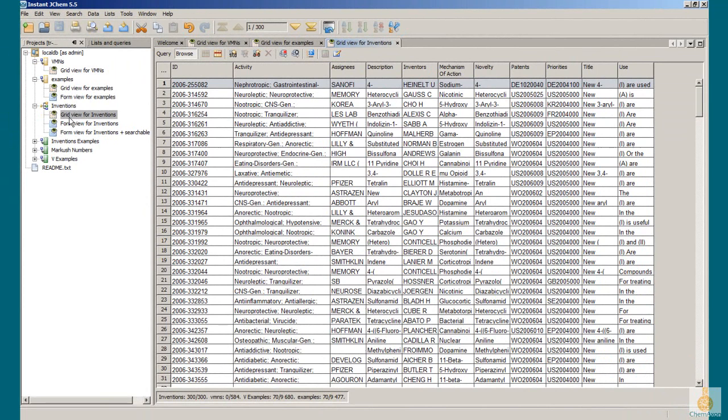On the bottom panel, the number of entries in each table related to different views is indicated. You can select which records you want to work with, not only by using the arrow buttons and the scrolling function, but also by simply typing the row number of the molecule of interest in the text field between the arrows. Now we are selecting 19.